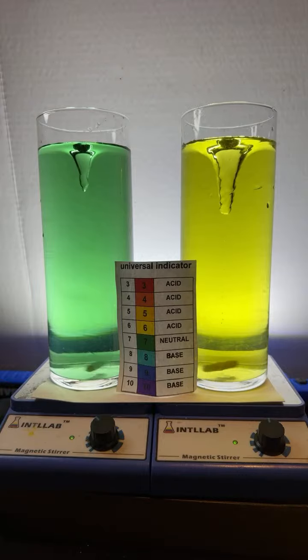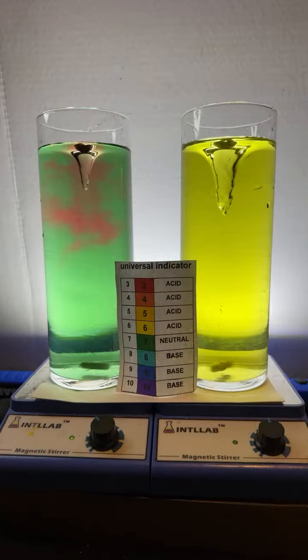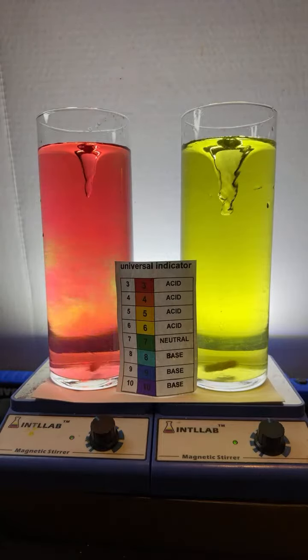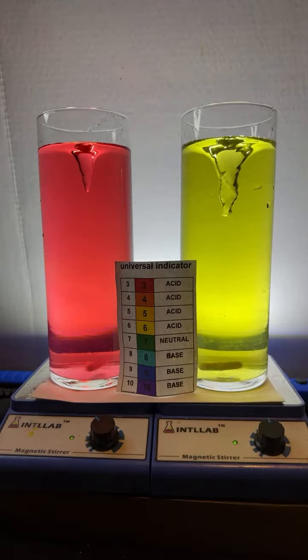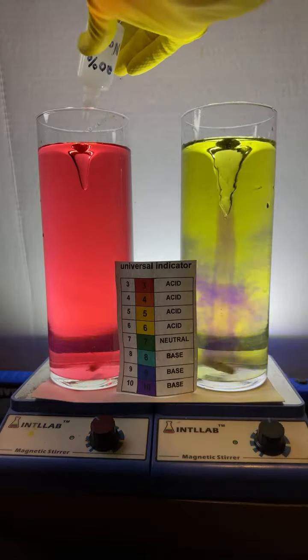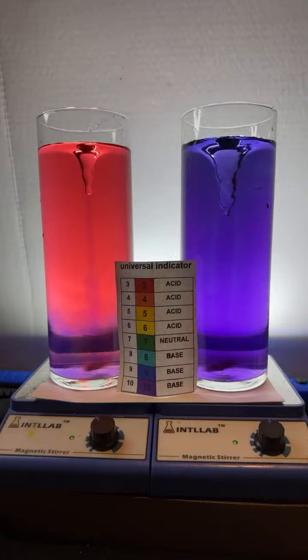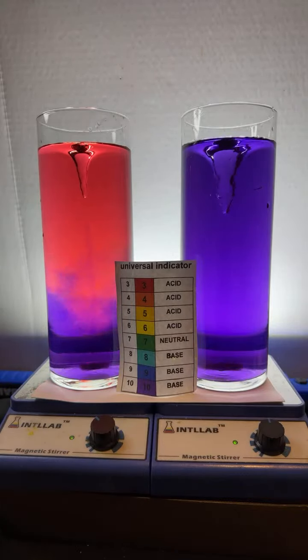All right, let's add a drop of acid over here on the left. Hydrochloric acid, same acid that's found in your stomach. And now we're going to add base to both. Here we go. 1 drop of base, sodium hydroxide base. That's a strong base. In goes 1 drop, in goes 1 drop. See some nice flow patterns. Really beautiful colors.